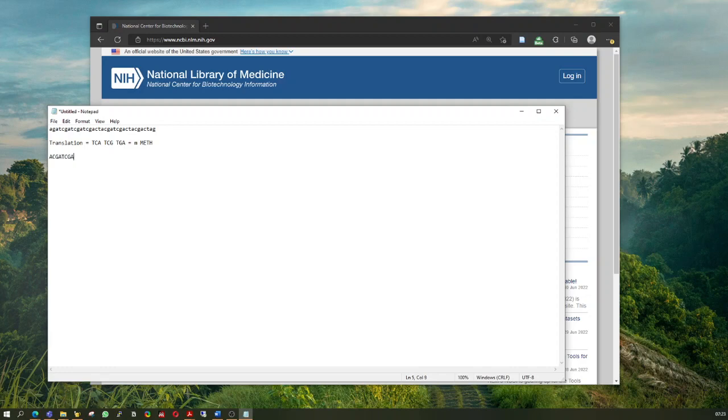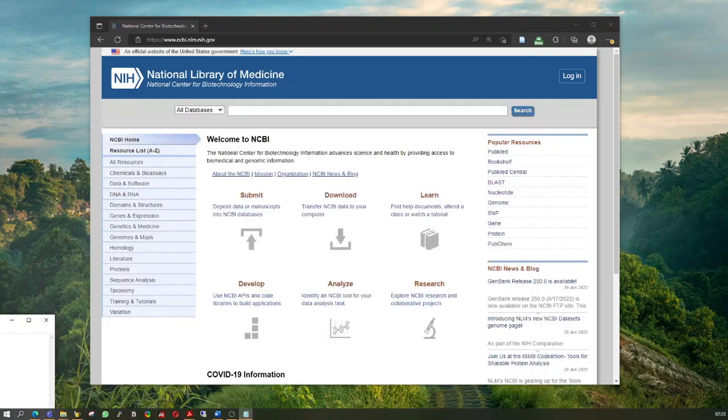Again, I'm going to type it like this, or it could take this form depending on whether you have protein or amino acid. And to make this data available to everybody, government and research institutes have created these websites that are just the front end of a large database of information. If you look on your left here, you see some of the resources that you can find on this NCBI. But this looks more or less like any search website or search tool that you see.